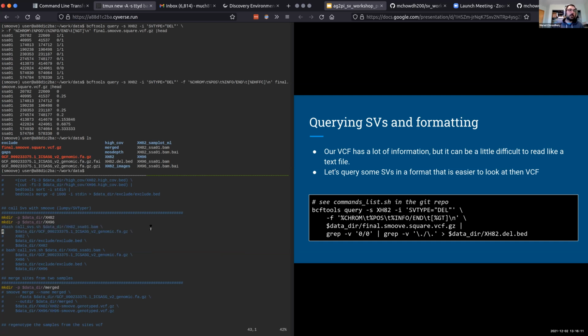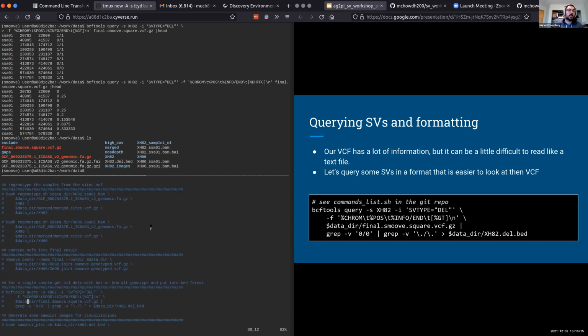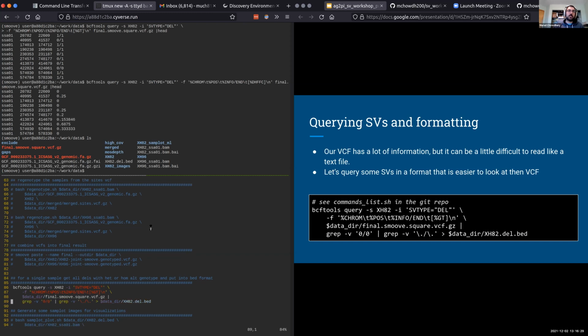All right, so the query is located here. Actually, I can get line numbers from this as well. All right, so it's present on line 86. So basically, I'm going to uncomment this and then run it. Basically, it just has the same commands that I have on the slide. Save and then quit.